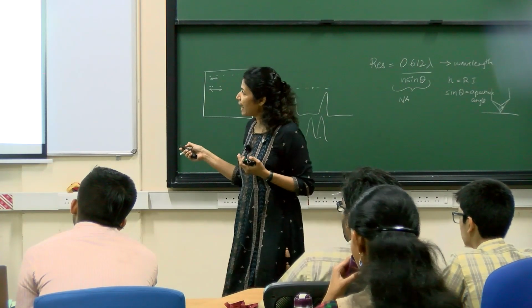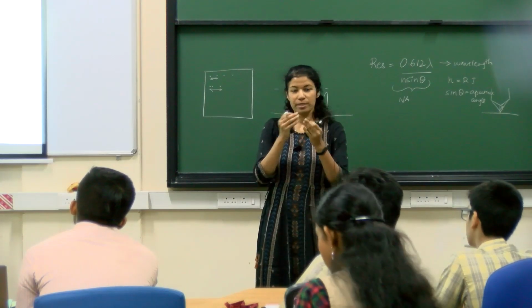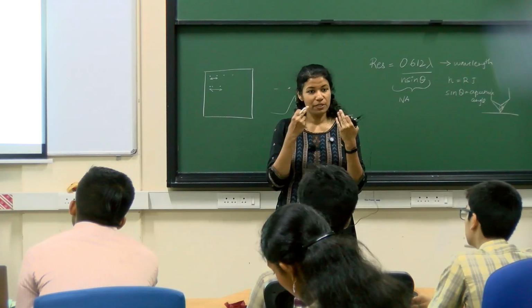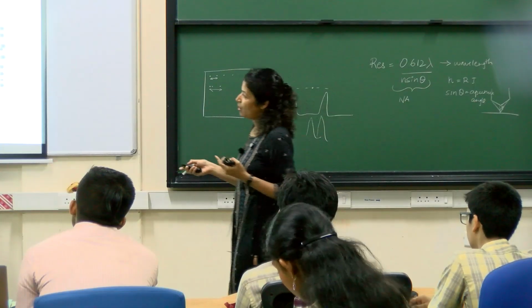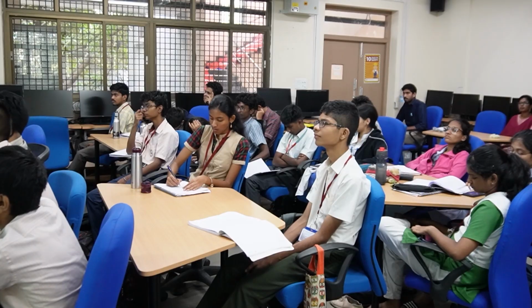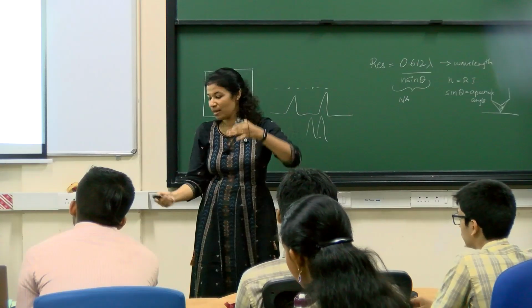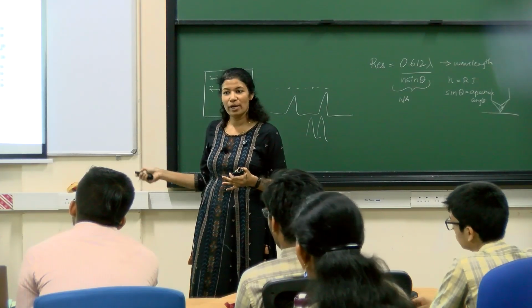So very simply, the diagram looks like this. You have a light source, you have a condenser lens which focuses the beam, you have your specimen, and then you have your objective here, and then this is your detector, which is your eye, okay? Now in an electron microscope, it is overturned. Everything is turned upside down. So I'm going to turn this microscope upside down, okay? And then change everything in an electron microscope.